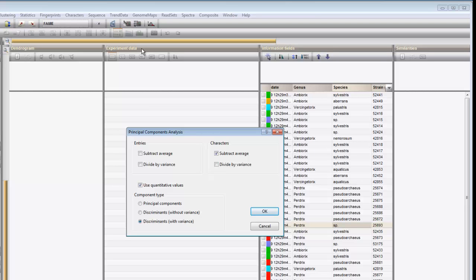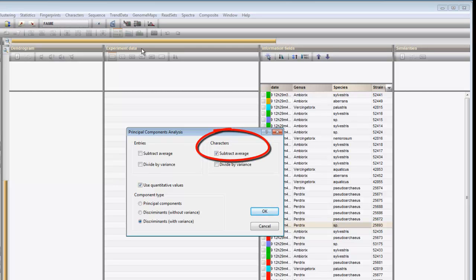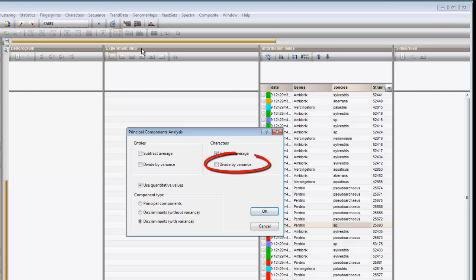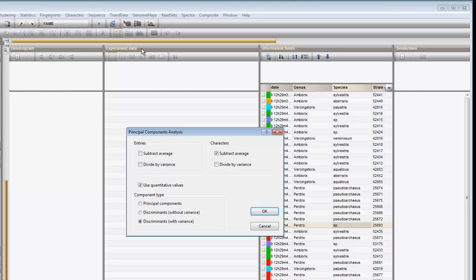If this option is unchecked, the character values will be converted to binary. Subtraction of the averages over the characters results in a PCA plot arranged around the origin, and therefore it is recommended for general purposes. Division by the variances over the characters results in an analysis where each character is equally important. I will leave this unchecked in this example.